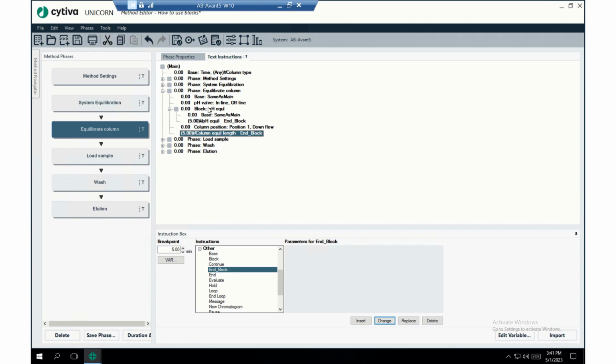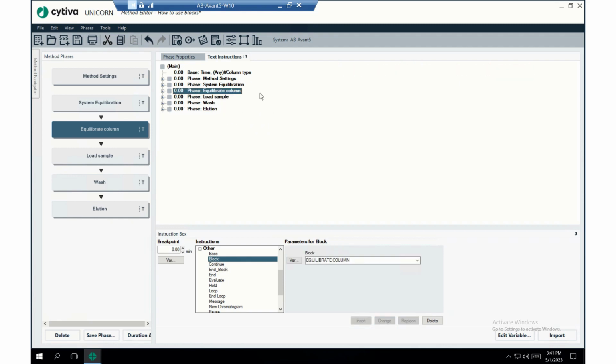So this allows us to insert a variable into a block, like a base variable that we weren't allowed to have before. Another great thing you can do with blocks is you can actually synchronize them. So this is really helpful actually.